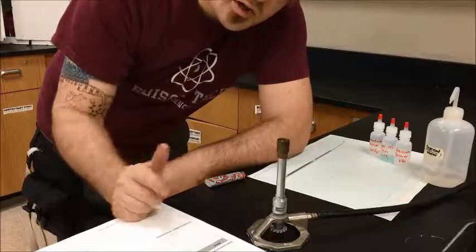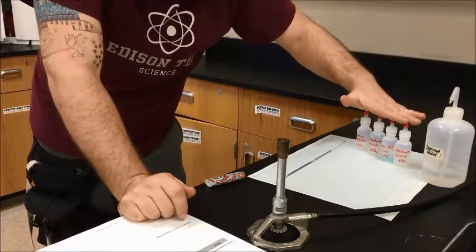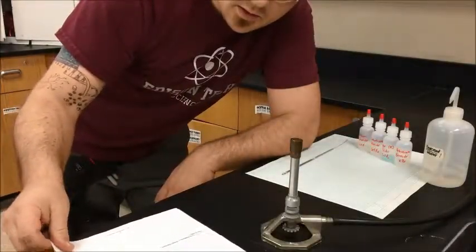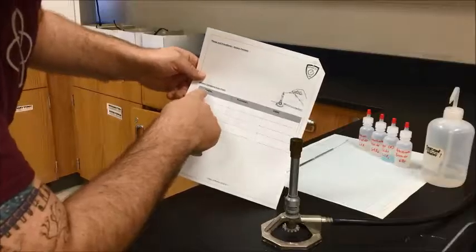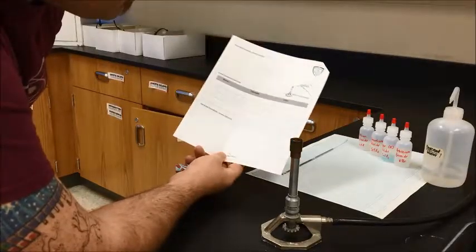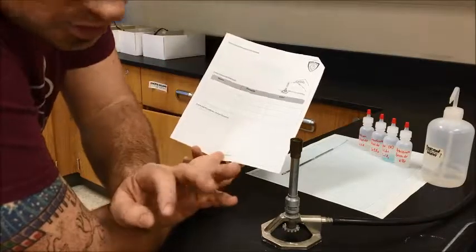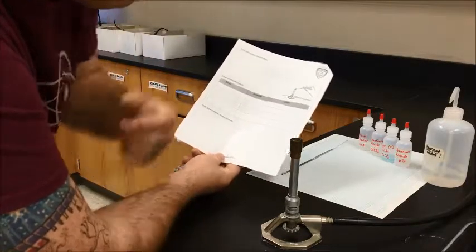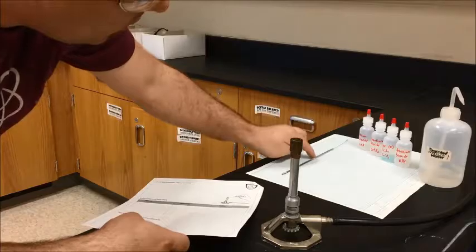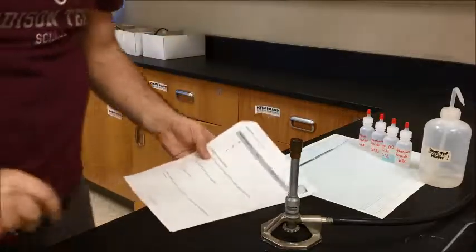For procedure-wise, the first thing you've got to do is make sure that your station is stocked and ready to go. You've got a wash bottle, the four chemicals, a loop, a nice piece of paper to keep things on, a burner, and your lab paperwork, obviously. And what you're going to do first is write down the names of the four chemicals and the formulas—they're written on the bottles as well. And the color that you write down here in your data is the color that you observe in the flame that's not orange, so the subtle colors that I'm hoping to see. That's for the known chemicals. And in between each test, you need to rinse off your loop with the distilled water. So you'll test all the known chemicals first.